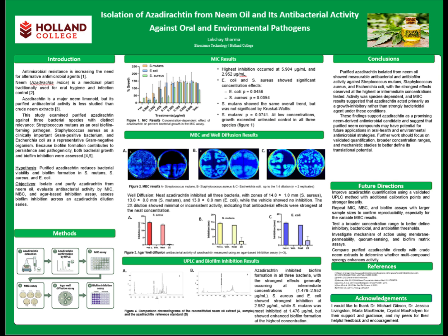The 2x dilution showed very weak and somewhat inconsistent activity, but it showed some inhibition in the range of around 3 millimeters in some replicates. Overall, this suggested that azadirachtin has measurable antibacterial effects at the neat concentration against both gram-positive and gram-negative bacteria.